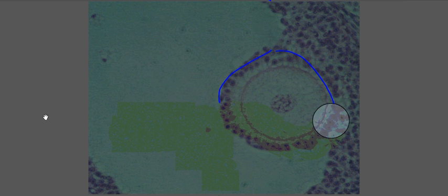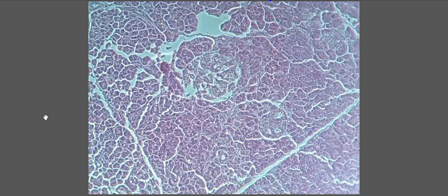Now you see that those slides are the same slides that you guys use. Okay? So what is this? I remember now. I forgot one. Group 3. You know what this is? And I'm gonna give you a hint.